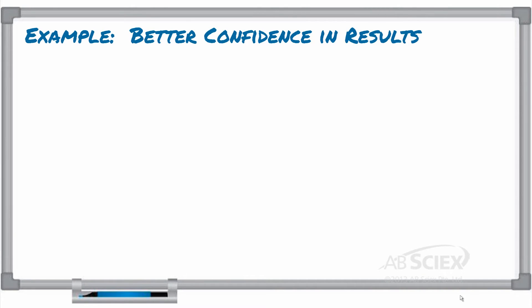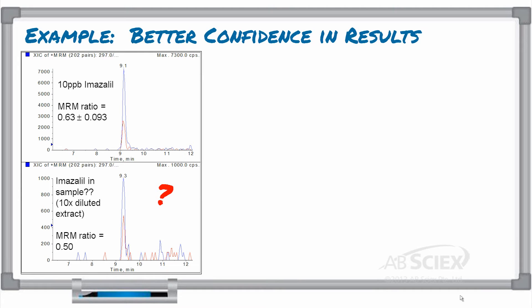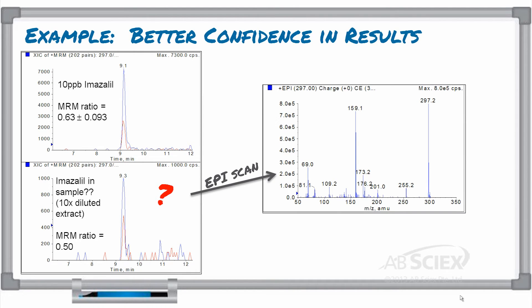Check this out — here is a great example. It looks like you've detected imazalil in your sample, but the MRM ratio is just slightly outside of the acceptable range of .63, plus or minus .093, identified from your imazalil standard. So you're just not sure if you should report the imazalil in this sample. If you're using a Q-TRAP, an EPI scan can be triggered automatically when the first imazalil MRM is detected, resulting in a full MS-MS scan of that peak. This means that more fragments are scanned and detected, giving you more information to confirm if this peak is imazalil. Think of a full MS-MS scan as a fingerprint for your detected compound.